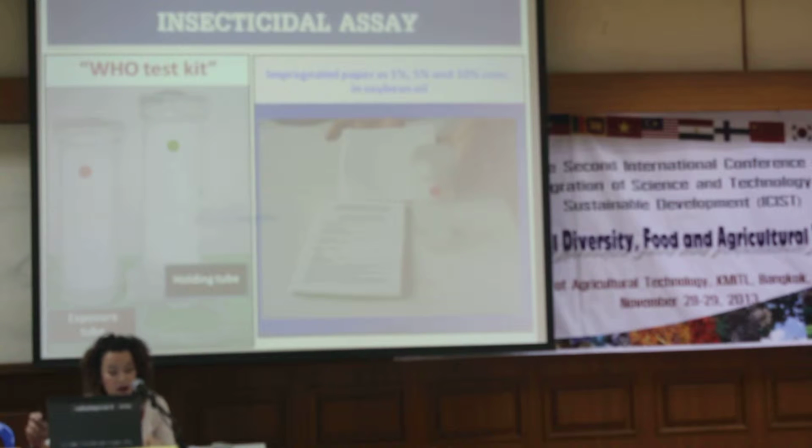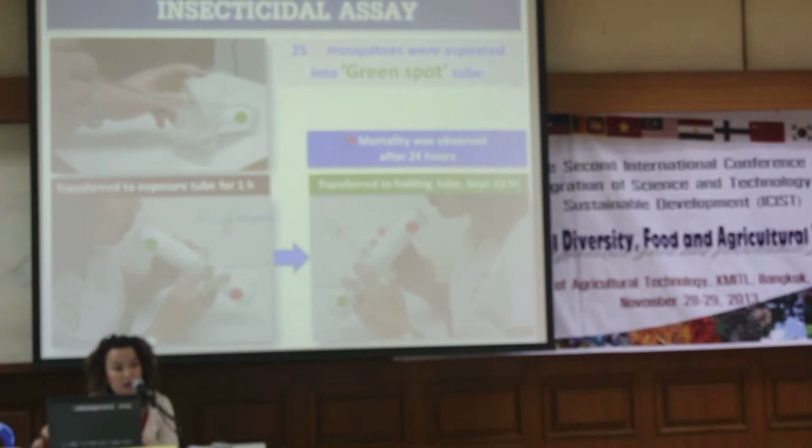We also prepare the impregnated filter paper. They were treated with essential oils diluted in soybean oil at 1, 5, and 10% concentration. So let's start the technique.